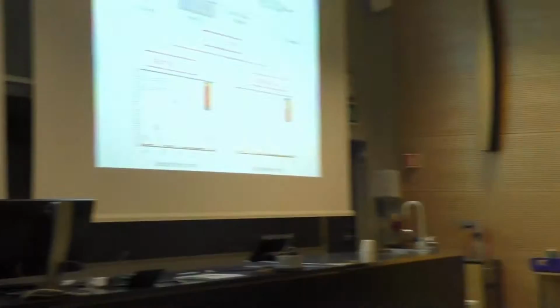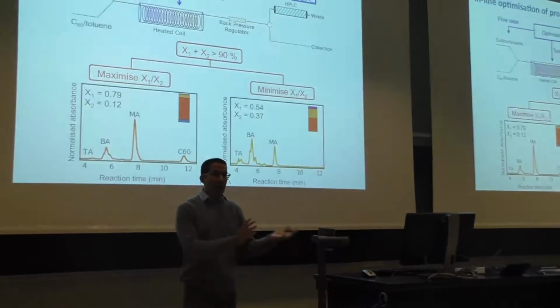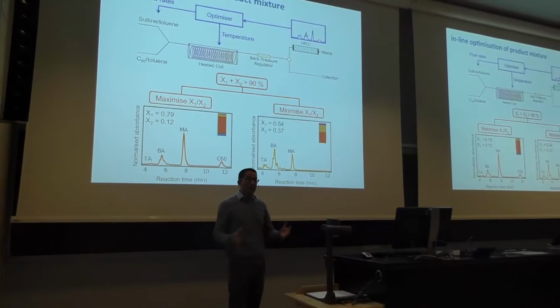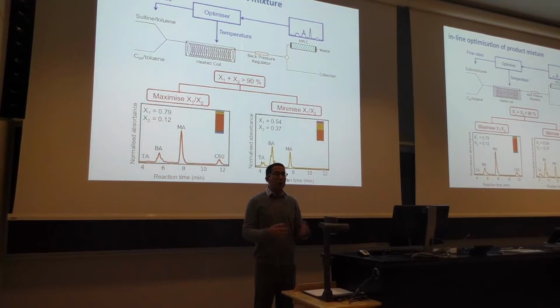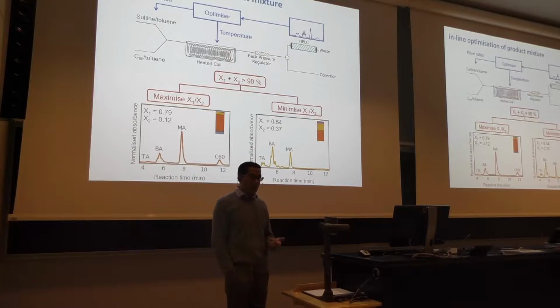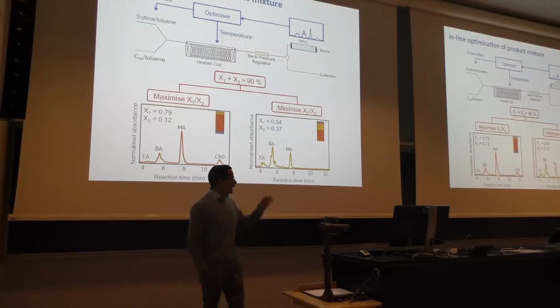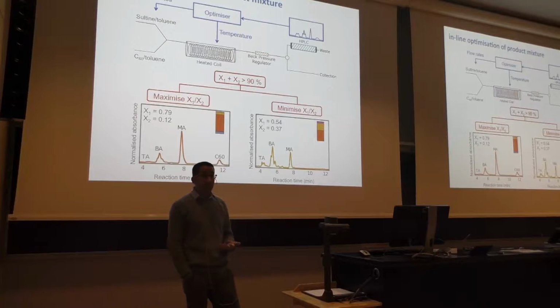Yeah, no, absolutely. I think in this particular case I showed you here, the limiting factor is less the analysis, it's 50-50 the analysis and carrying out the reactions. The reactions are relatively slow, the analysis is relatively slow, so at worst it trebles the total time. But we're also looking at droplet-based systems where we can generate different compositions very, very quickly. And here HPLC would be a complete waste of time. So what we definitely have to use there are spectroscopic techniques that can give us instant information.